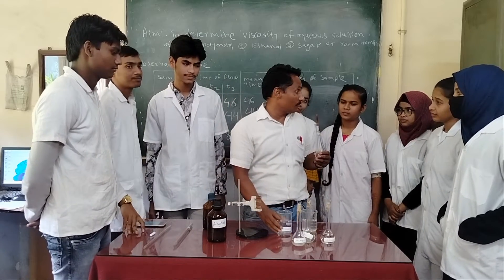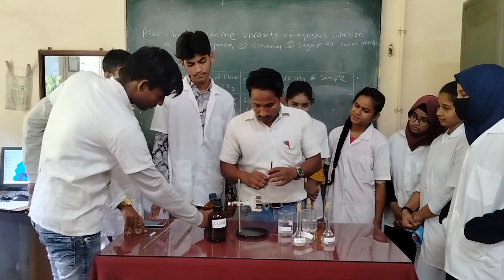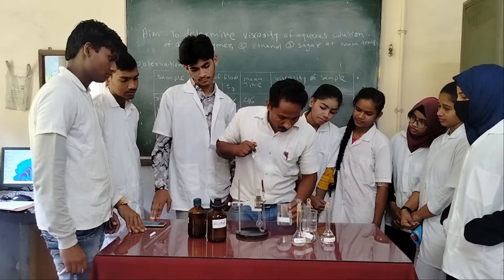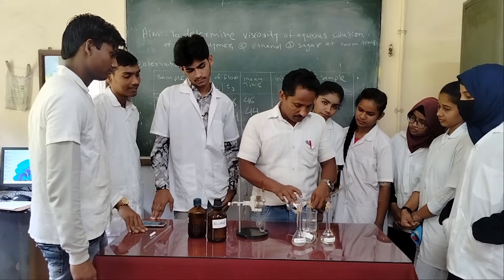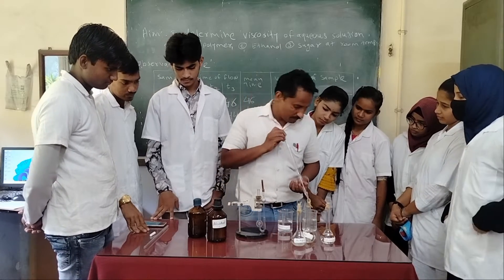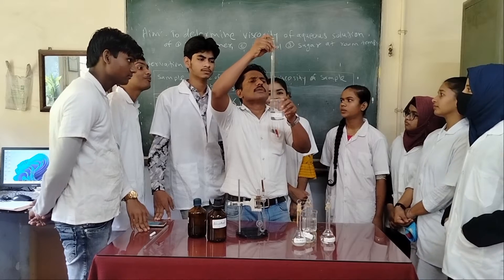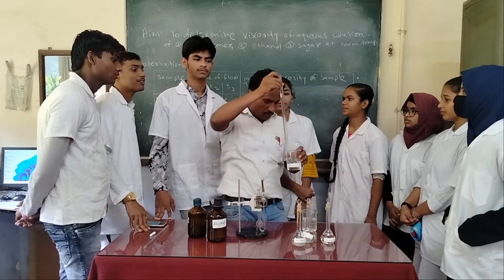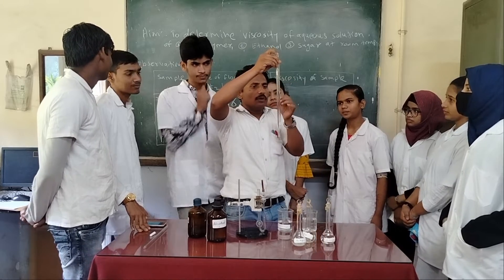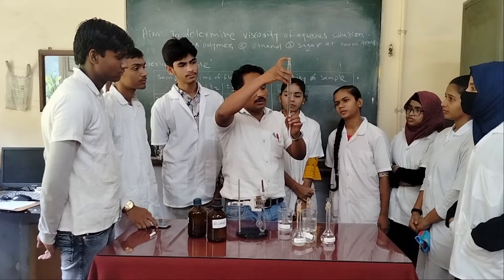First, take a definite amount of water. Have you cleaned the viscometer? Yes. If you will stand the viscometer, transfer a definite amount of this water. This is a graduated pipette — graduated means we can measure the volume of each ml in this viscometer. The total volume is 25 ml. So after 25, we are going to fill 22 ml.